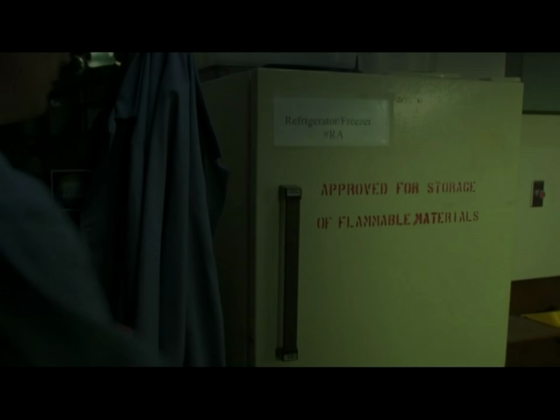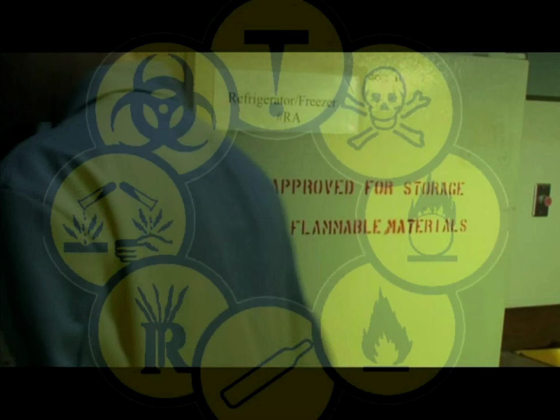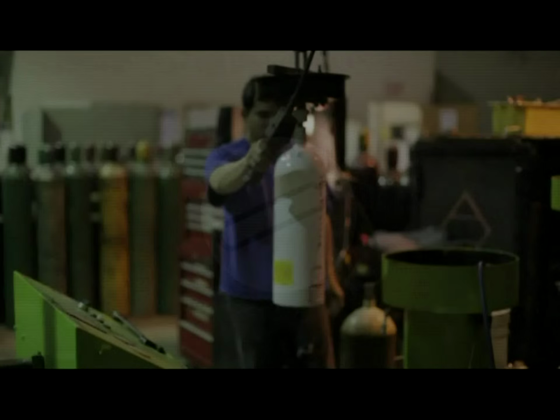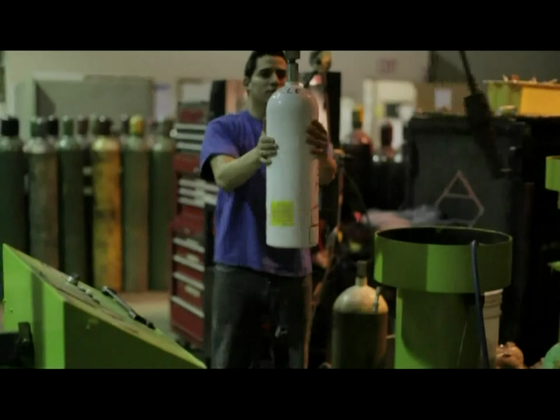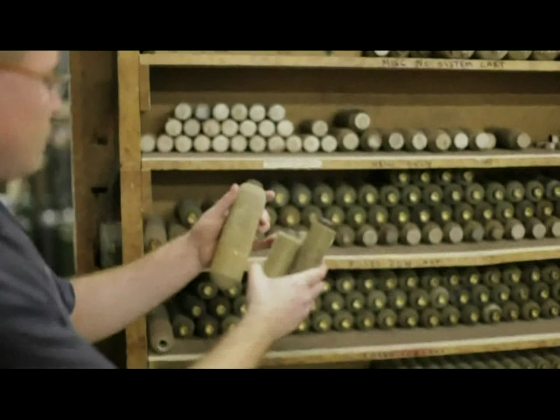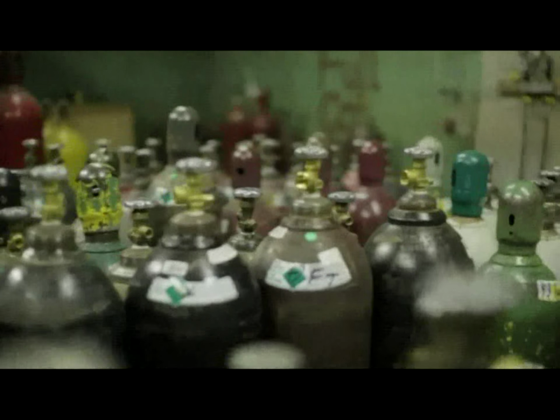However, there is a possibility such materials could be found in some specific environments, such as science lab storage facilities. Hazard symbols. Take a look at this symbol. This means that the gas within the cylinder may explode because it is under pressure, may explode if heated in a fire, may explode if dropped or crushed. Therefore, you should handle cylinders with care.